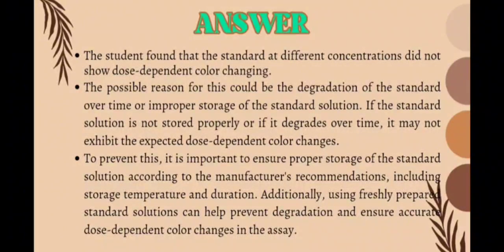If the standard solution is not stored correctly or if it degrades, it may not display the anticipated dose-dependent color changes. Degradation or improper storage could lead to alteration in the chemical composition of the standard, affecting its reactivity in the assay.